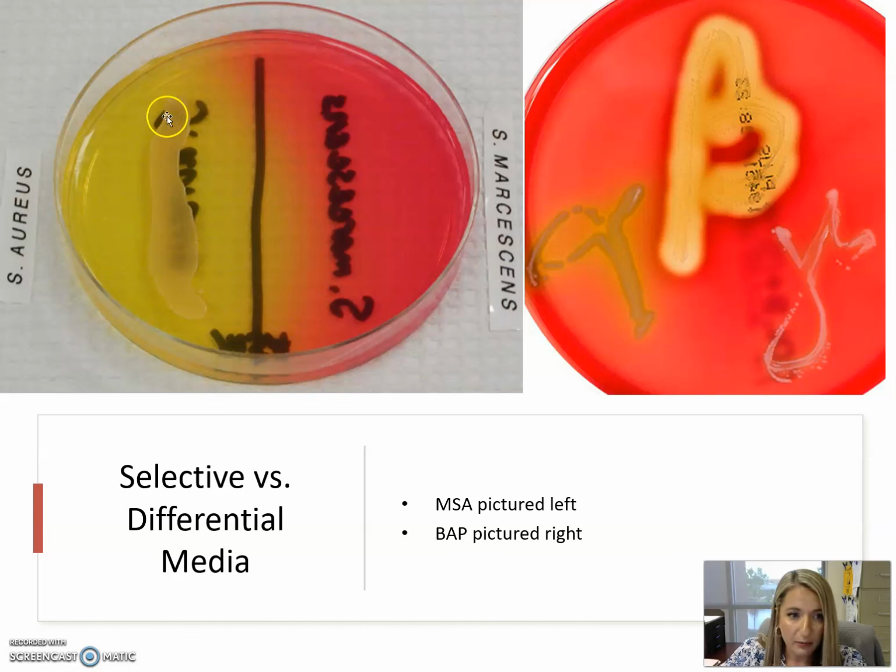So in this plate, we've put Staphylococcus aureus over here and Serratia marcescens over here. We put two in, only one has actually grown though. So the Staphylococcus aureus was able to grow because it enjoys a high salt concentration. The Serratia marcescens though was not able to grow, likely because it was dehydrated due to the high salt concentration and shriveled up and died.